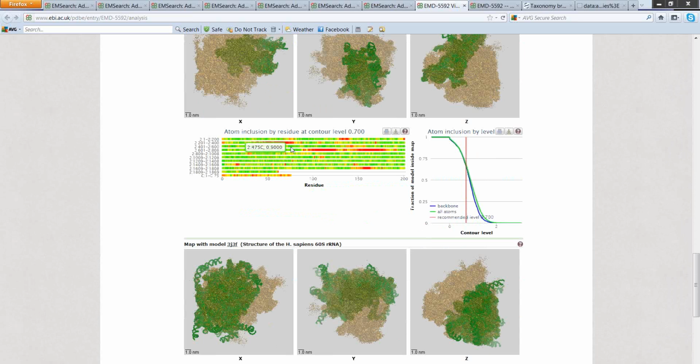Now, if you go to the RNA models, what you find is that there's a lot of green here. And the reason for this is that RNA secondary structures are usually much larger. But rather than having side chains sticking out, with RNA secondary structure you have the bases, you have base pairing, so you have the bases sticking into the density. So usually you have the backbone of the phosphoatoms running along the edges of the density, and you have the rest of the atoms facing into the density.